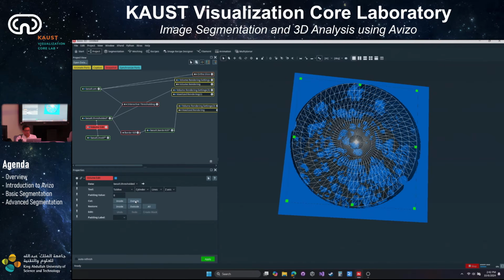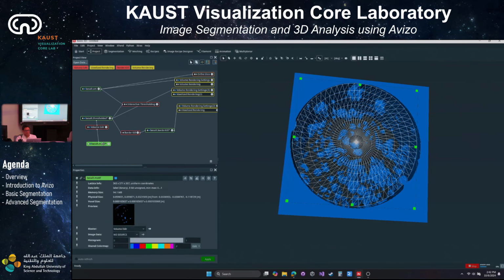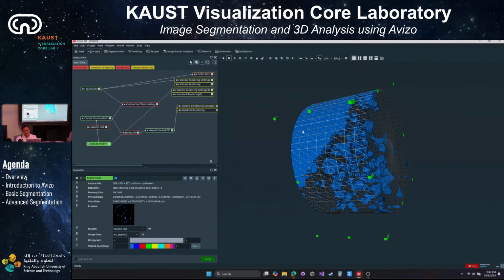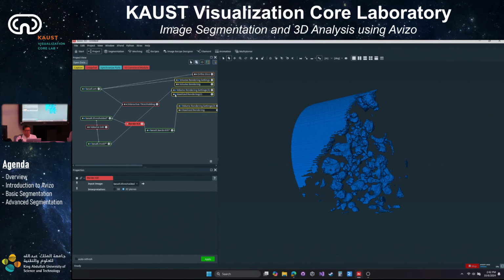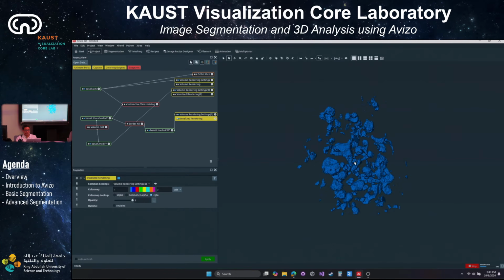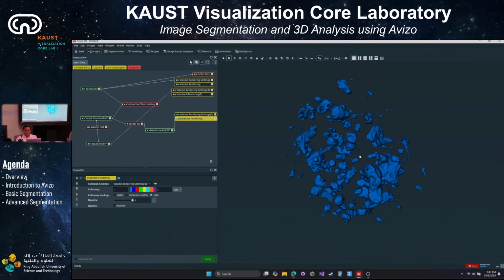And then let's say I want to cut outside, I think. Yeah, and it gives you this result, right? Yeah, so of course, I missed this part. So just from experience, and depending on your need, I would prefer the border kill example, okay? So this just shows you that there's different pathways to get to your result, okay? So for now, let's say I'm happy with this result. And I can already measure this, right?